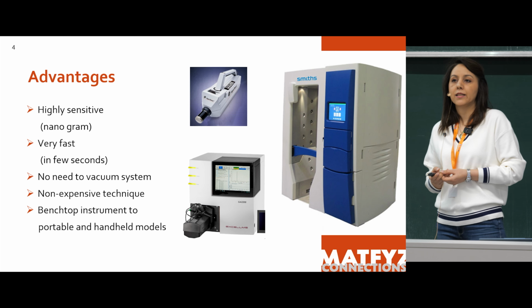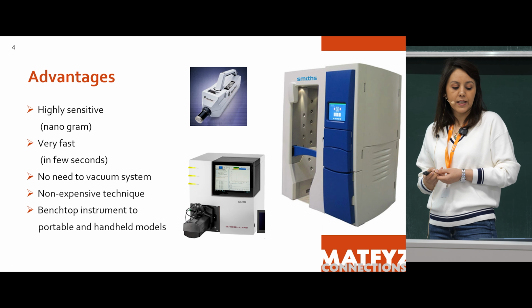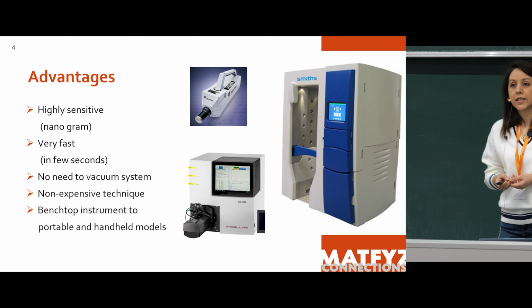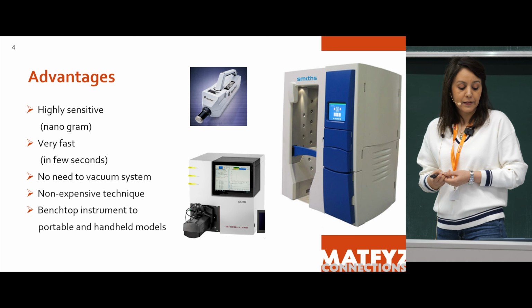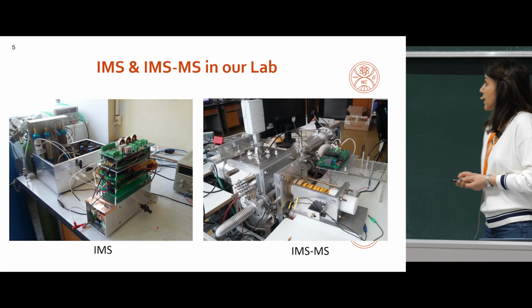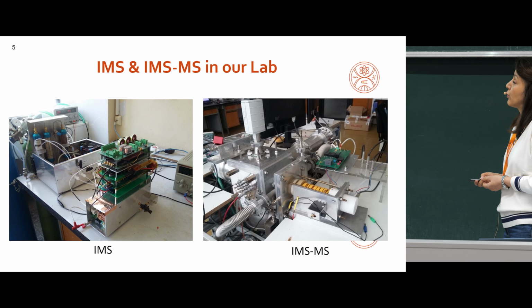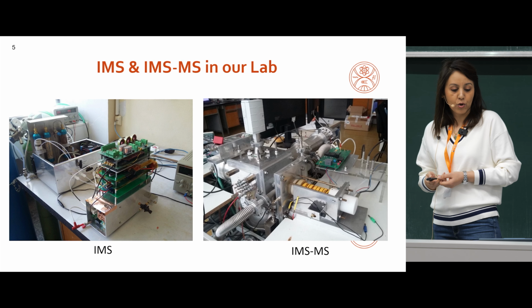It operates at atmospheric pressure, so it doesn't need a vacuum system, and this technique is inexpensive, and it's available from benchtop to portable and handheld design. This slide shows real photos of IMS and IMS coupled to mass spectrometry that are developed in our lab.